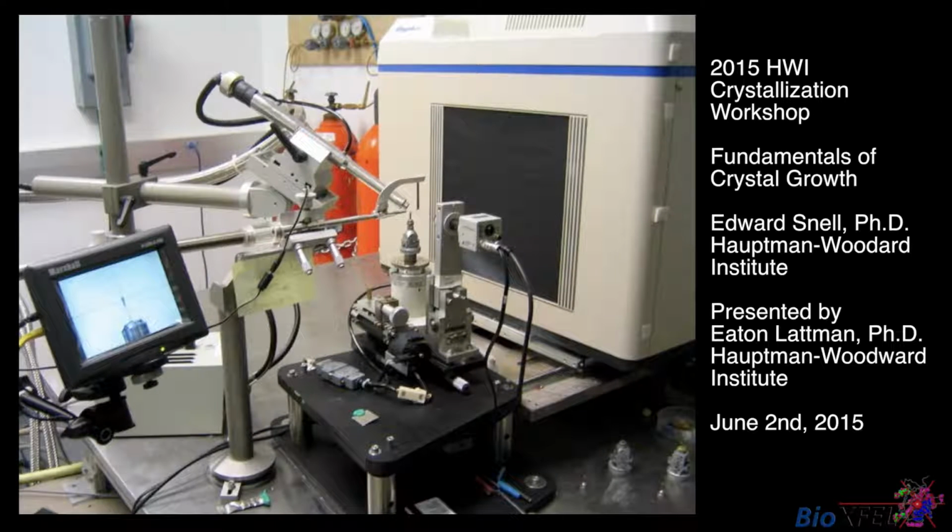This is a picture of a typical laboratory setup. Here is a detector. Here is the goniometer holding the crystal. This is a cooling jet. Here's the X-ray beam. And these things will look familiar.